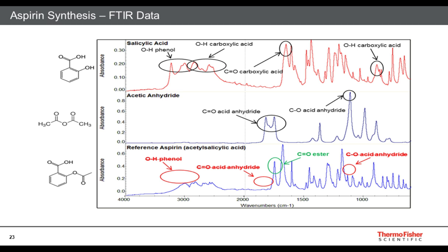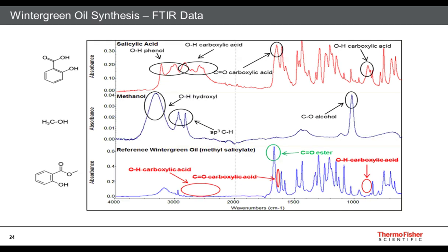So it's pretty clear, and the students can look at this, relate it to their tabulated data, and justify their conclusion that the reaction was indeed successful by analyzing these individual spectra and the spectra of the final product.